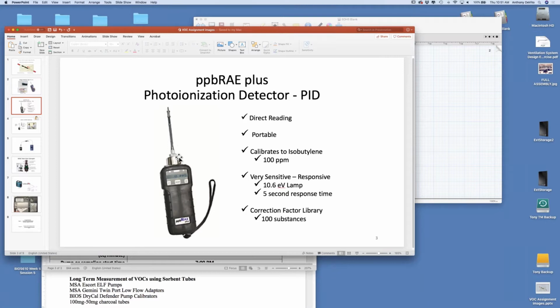Air is sucked in through the instrument. There's a photoionization cell, basically a cell where a very strong UV source, ultraviolet light source, exposes the gas that's coming through here, the air and the gas that's coming through here. The outer shell of electrons are excited or moved off, creates ions and ionizes that organic material, which makes the air passing through here more conductive. And this can read that increase in conductivity, and feed back to you how much of that VOC was present in the air.